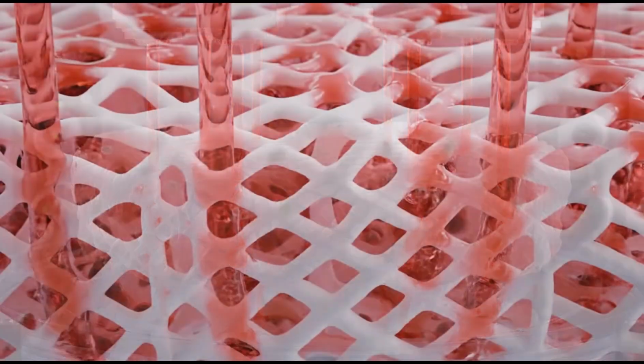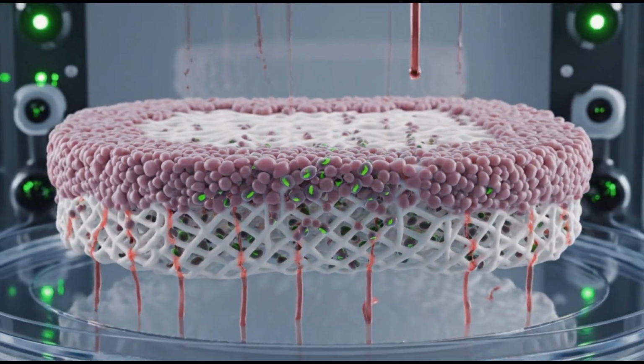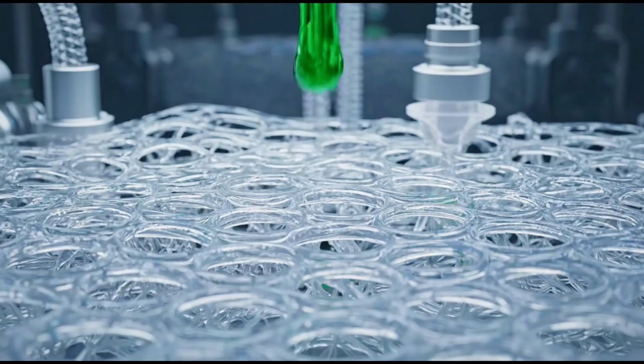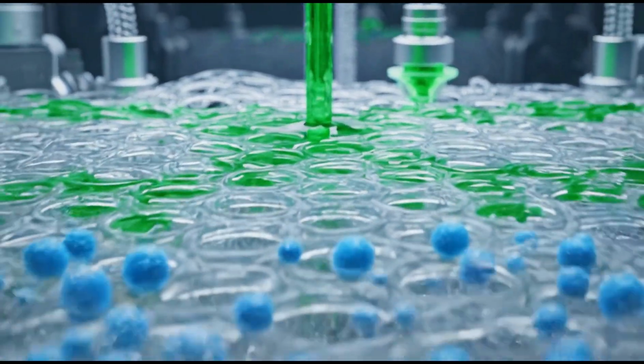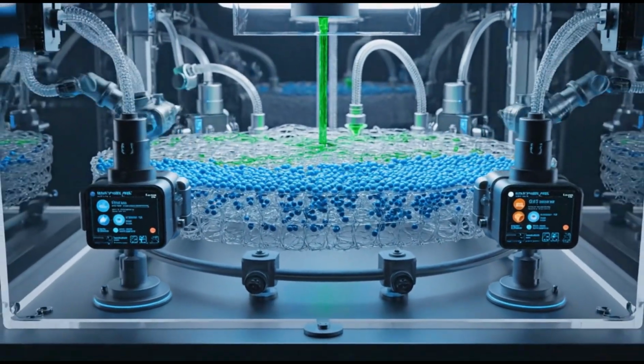Automated systems regulate nutrient flow through scaffolds. Even distribution supports uniform cell growth. Cells multiply while remaining attached.